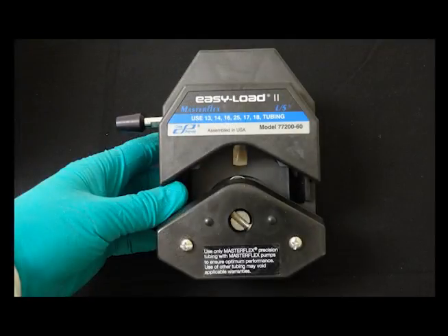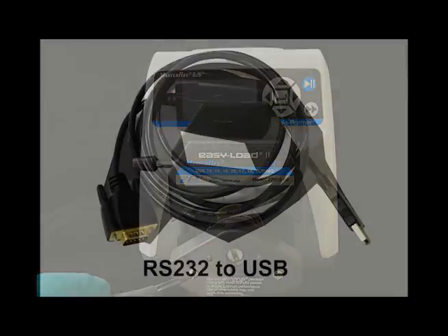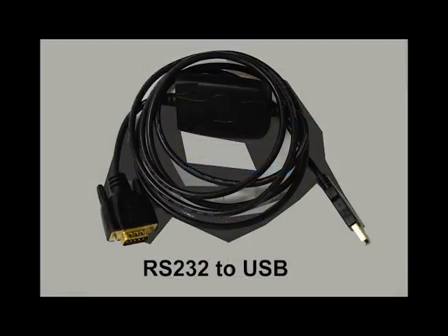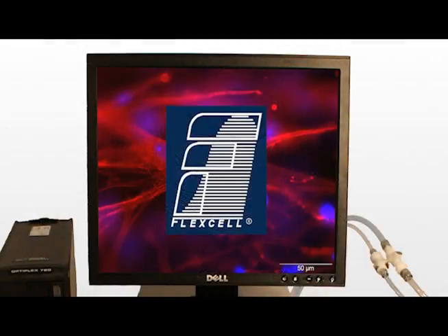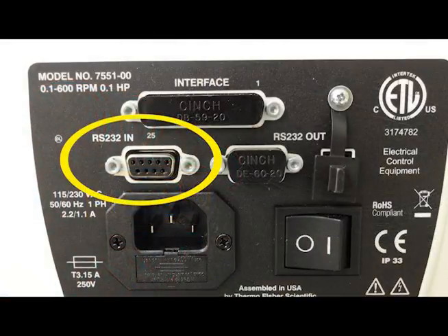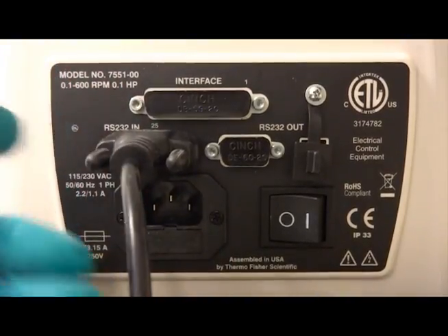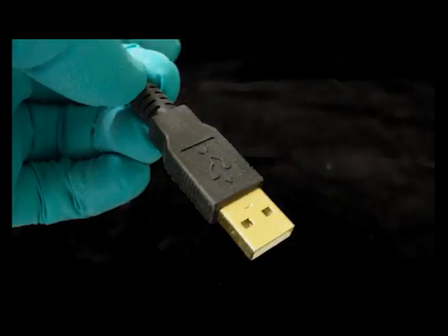Before setting up your system, please ensure that the pump head of the MasterFlex peristaltic pump is attached to the pump body. Also, please install the RS232 to USB driver using the CD included with the cable to your computer that will be used with the FlexFlow device and operating the StreamSoft software. Using the provided RS232 serial to USB connector cable, connect the male RS232 serial cable end to the female RS232 port on the back of the MasterFlex pump. Connect the USB end to your computer.